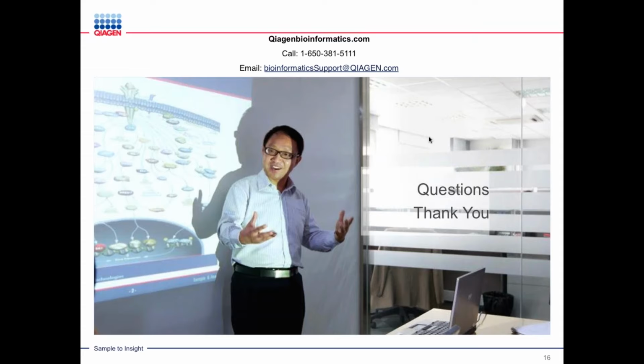Let me open this up right now. So the first question is, how did you produce or obtain the annotation file that you imported right after you imported your reference sequence?